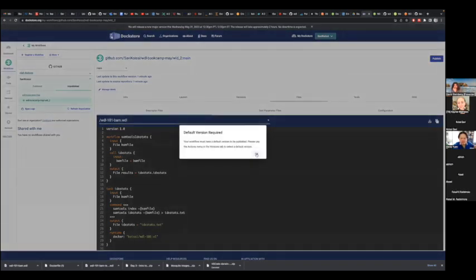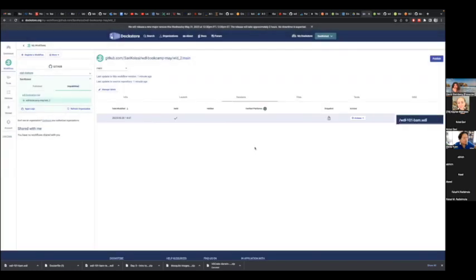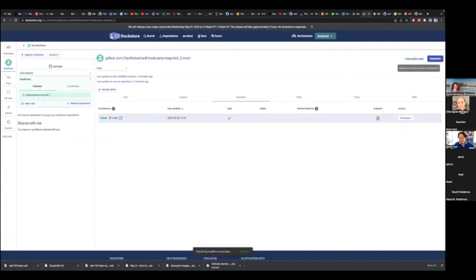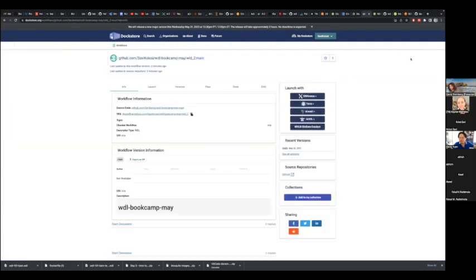So set the default version by going to the versions thing there, actions on the right. You were on the right table, right there. And then actions, set as default version. And now try publish again. Great. And then you can click that view public page link that just popped up right there.